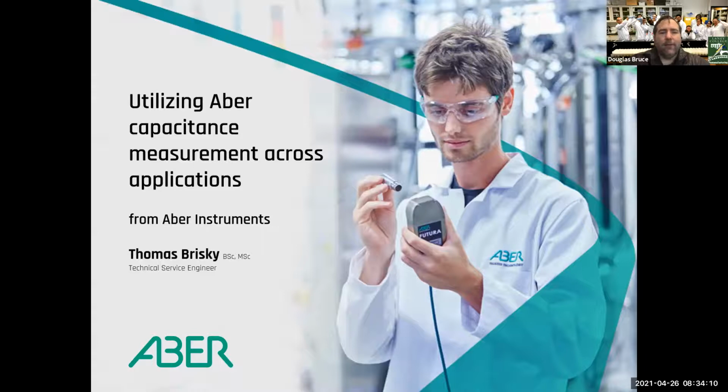And to those of you here live and those listening after in the recording, we're welcoming Thomas Brisky today from Aber Instruments. Thomas is a service engineer with Aber, and they make these capacitance measurement tools and other tools for all kinds of industries, including the food, brewery, and biotech industry. And today we're going to learn about capacitance and its applications to biotech. So very excited, Thomas, to have you here today, especially someone who does the on-the-ground work with industry, because that's what we're all about. So looking forward to hearing about those industry applications.